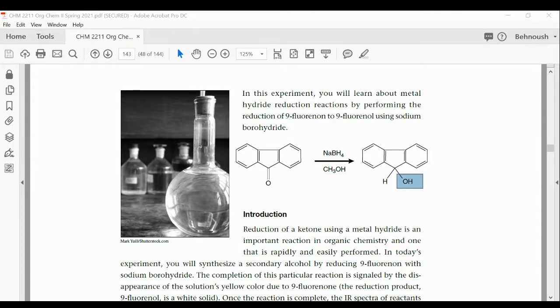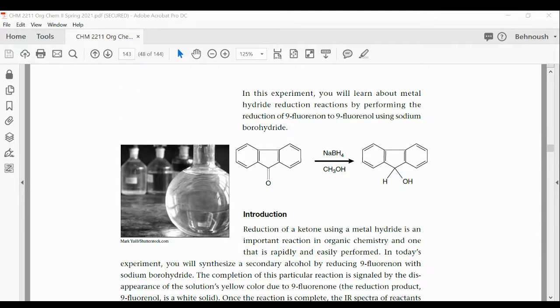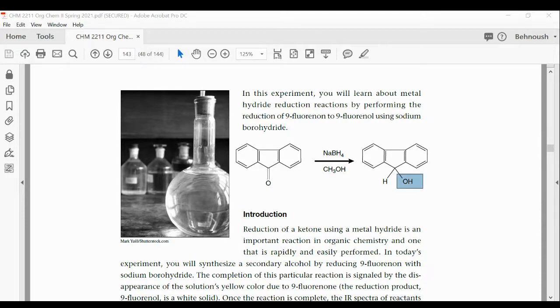Okay. Because I graded a few papers and I noticed that if you use 0.4 milliliters, and multiply by the density, you end up with 0.49 grams as the mass of the reactant.